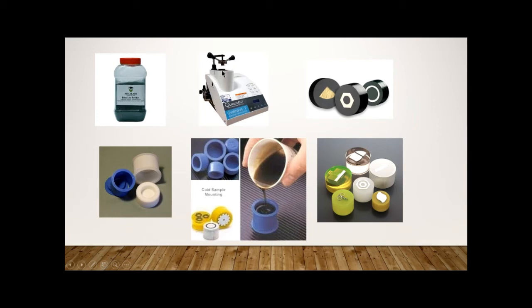Then by using the hand press, you should lock it, then turn it, then switch on the cycles. There are digital options available for how much temperature you have to maintain and how long. If necessary, you can go with cooling water cycle. It will carry out the excess heat. Later, the operation is over. Your sample will be mounted and it will look like this only.